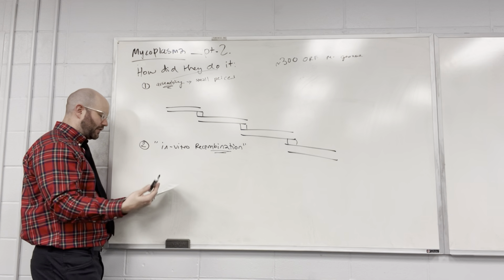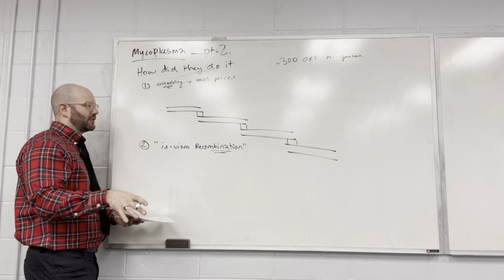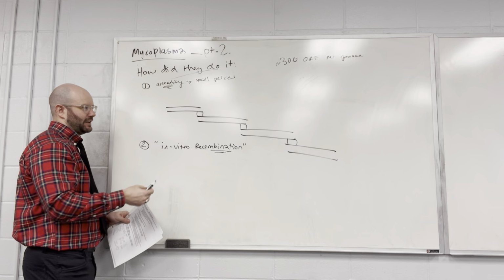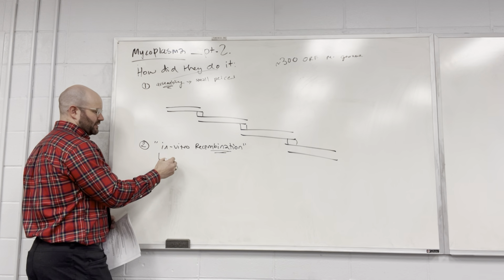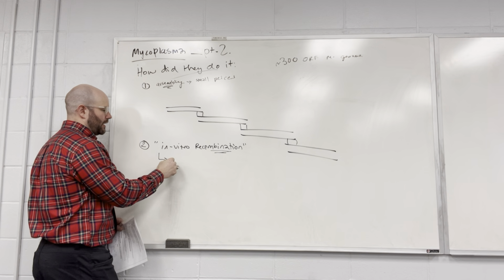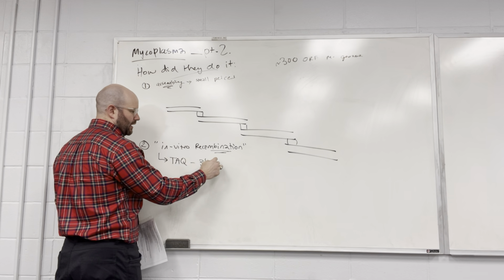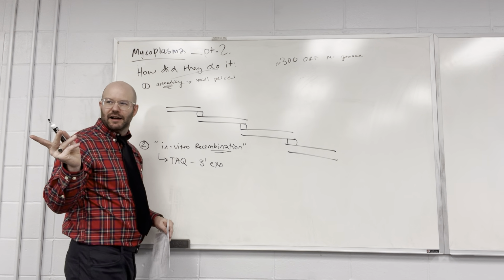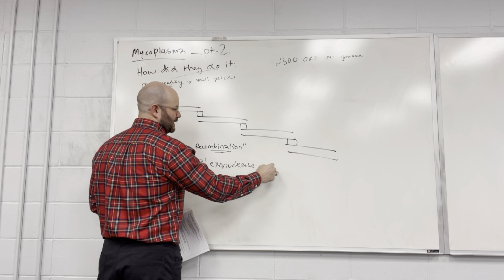We've actually covered figure 1 part A before in a lecture. How do they generate the sticky ends? They don't have the perfect enzyme for this yet, but they have this Taq that has 3' exonuclease activity.